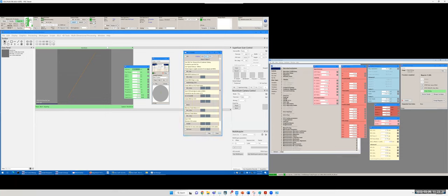For now, I want to take MOA out because I want to see a larger view. Oh, okay. You can see VOA is here. MOA, we moved MOA there, right? This is the MOA current location, and this is the current VOA location. So these are very off. Actually this condition is nearly on the edge of where you can tune this.